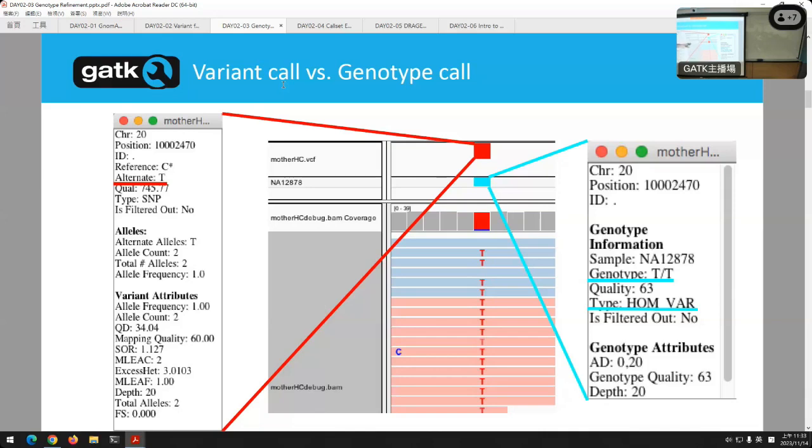It's not the variant caller's fault. It's doing the right thing. It sees it right there. Okay, but we still have high confidence that the site is real. We might have no confidence in the genotype. But we have a very high confidence in the site, and that's important. Okay, so I don't want to filter this out just because I don't have confidence in the genotype. Because I know this thing is real. I just don't know exactly what the genotype is. Good? Okay.